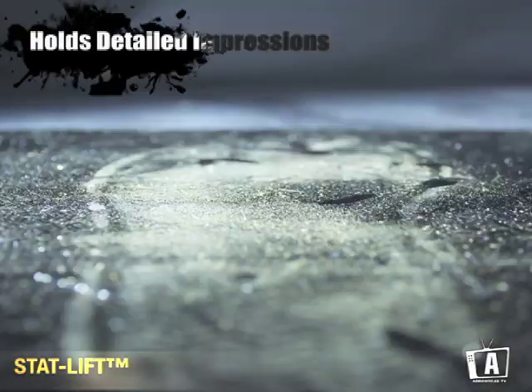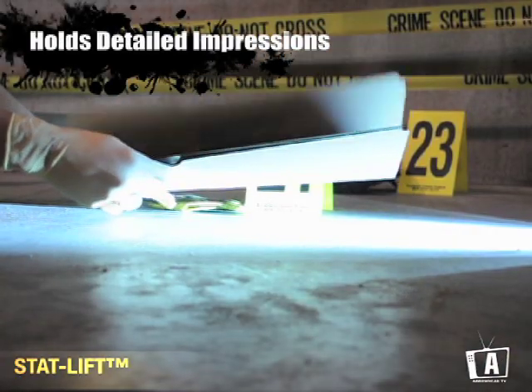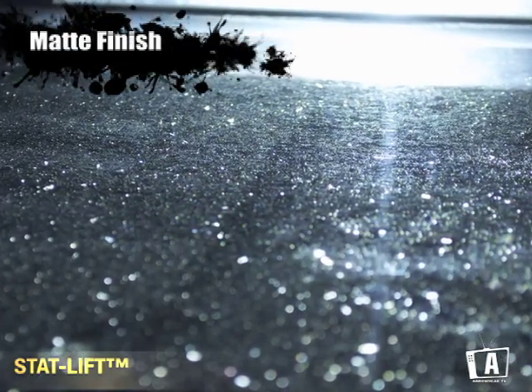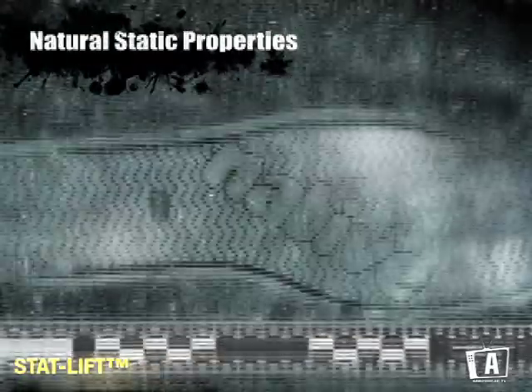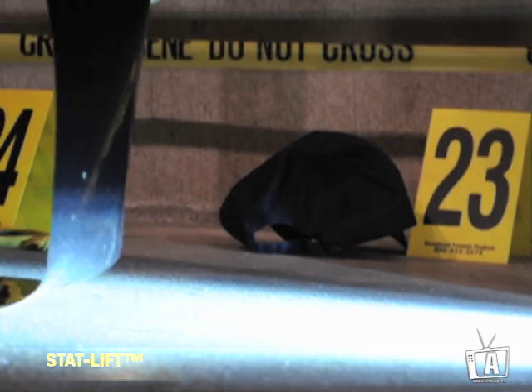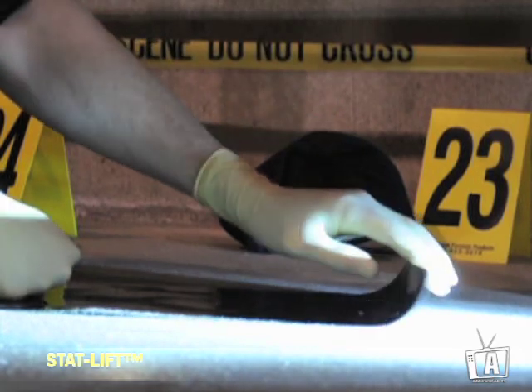StatLift holds detail in all conditions and preserves detailed impressions when stored properly. StatLift is produced with a matte-like finish that reduces the amount of specular highlights, which is ideal for photography. StatLift's natural static properties do not require any additional charge. The natural charge produced inside StatLift will pull the dust particles from the impression surface directly to the applied lifter.